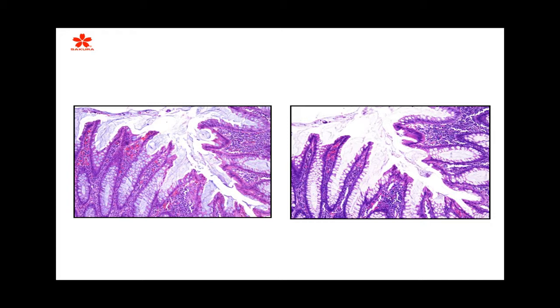Now, we do this stain for a pathologist. Actually, he could care less about all of this endogenous, non-specific hematoxylin staining. This is actually just junk. If we look at the slide on the right, the goblet cells are basically clear of any mucin. This slide on the right was actually overstained, stained longer than the slide on the left.